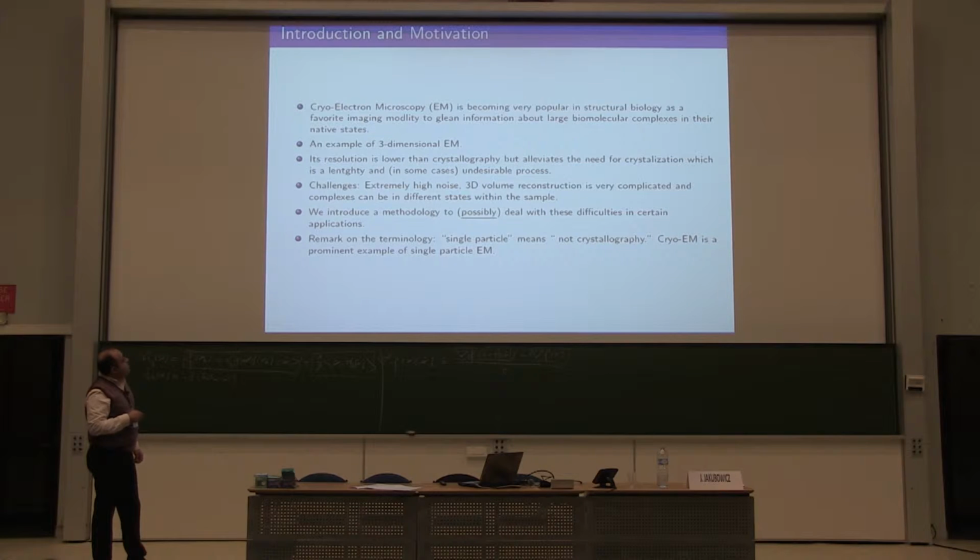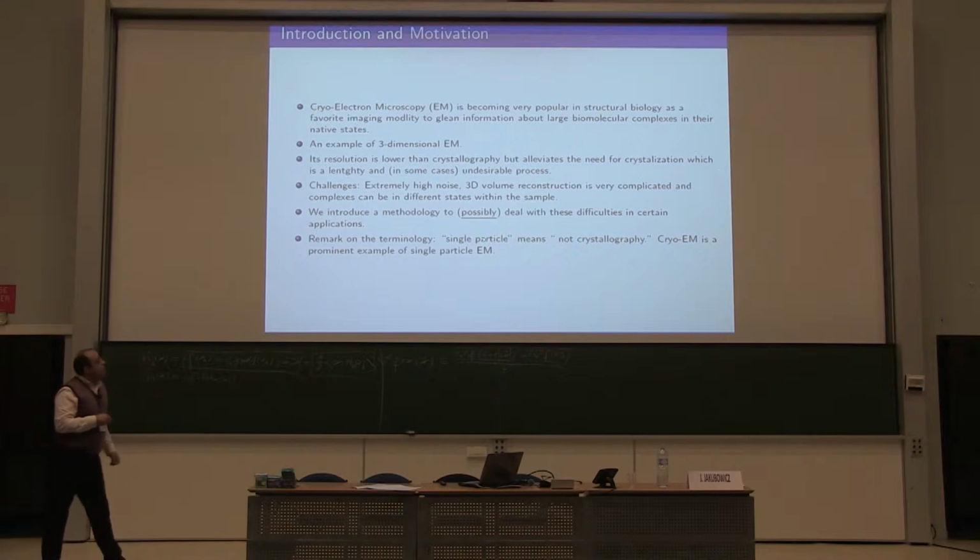For that reason, cryo-EM is becoming one of the most popular ways of getting three-dimensional structure in structural biology.